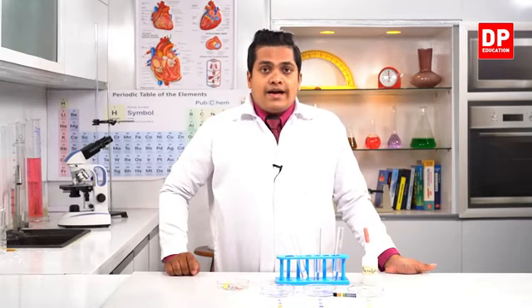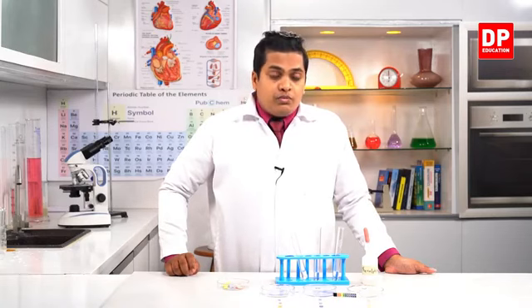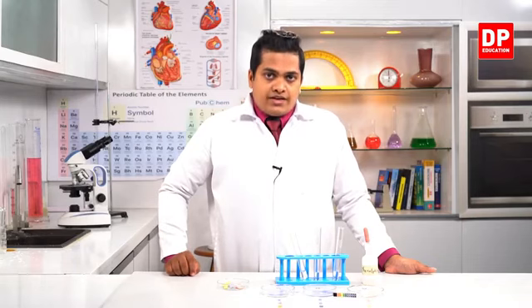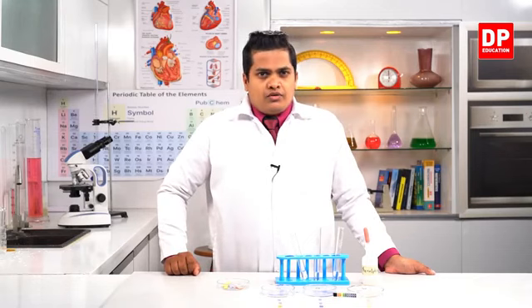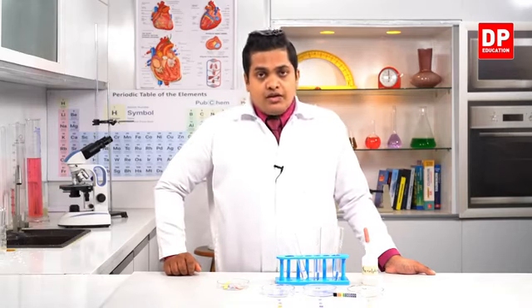So acid gives out a red related color. Blue litmus is converted to red color with the presence of an acid, and pH papers also show a red related color, like orangish yellow or red, when you insert a pH paper into an acid solution.